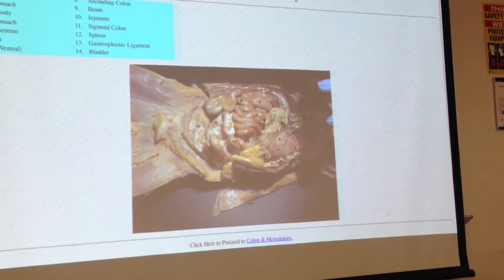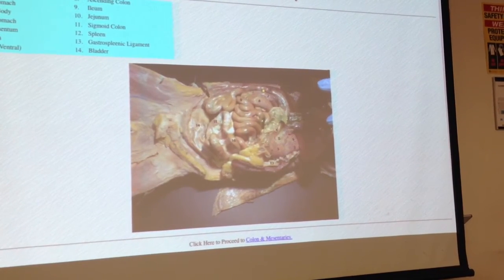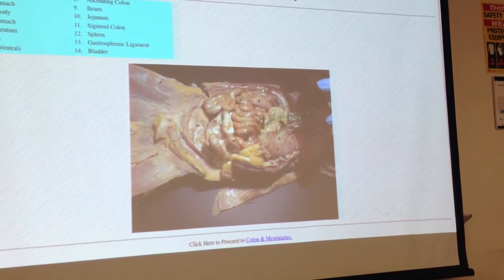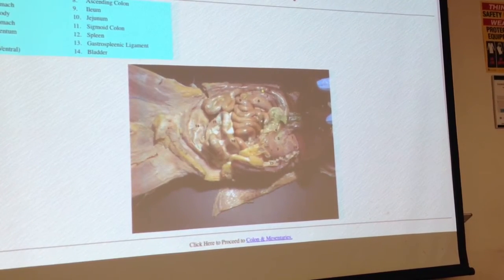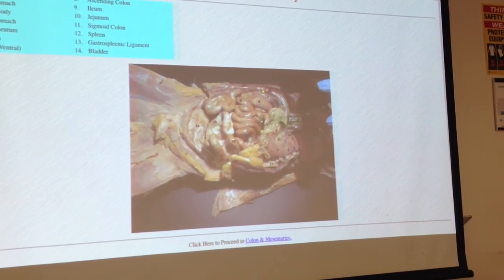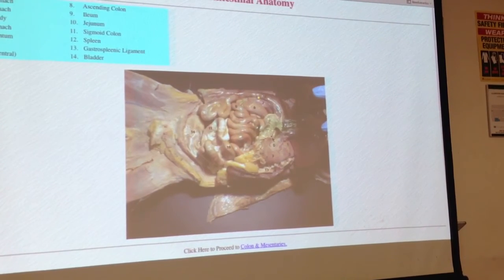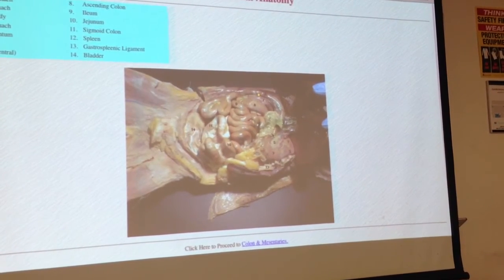All right, so now for the parts of the stomach. The very top, remember, that's the cardia. Then we have the fundus, which is kind of the top turn of the C. The main angle of the C, or like the back of the C, is the body. And then we draw the line right here. I think 4 right here is where they're saying the pyloric stomach is.